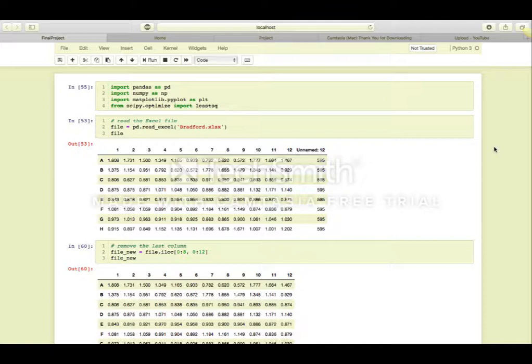The values from A1 to C3 are our standards measured in triplicate, where every 10th value is a replicate. For example, A1, A10, and B7 are replicate measurements of the same standard. The values from C4 to H12 are the experimental samples run again in triplicates. However, here C4, C5, and C6 are an example of replicate measurements.